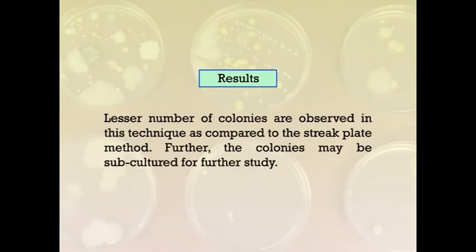In the result, a lesser number of colonies are observed in this technique as compared to the streak plate method. Further, the colonies may be subcultured for future use.